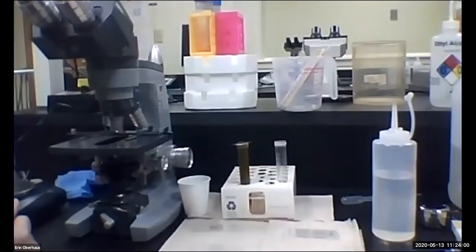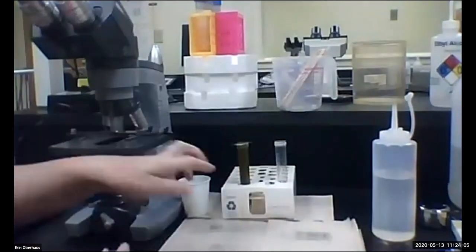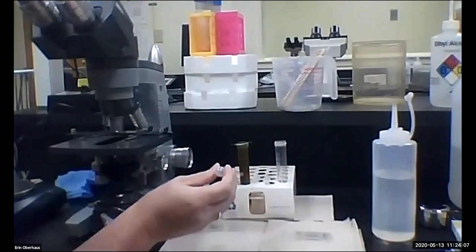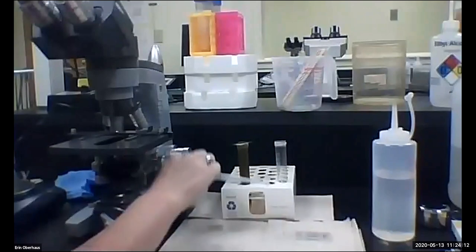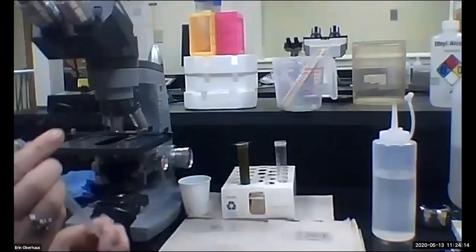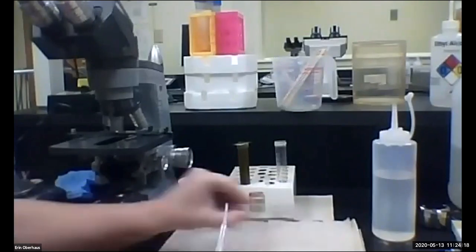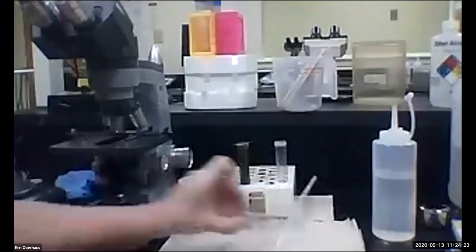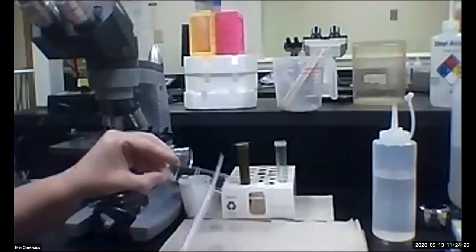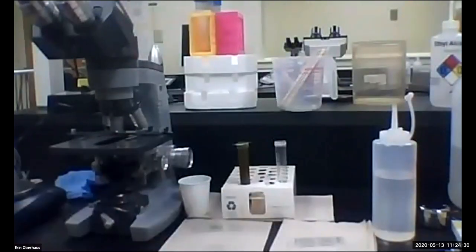If you were using the McMaster technique, you would take a transfer pipette and, instead of putting this into a tube with a cover slip on the top of it, you would probably just pour it into a clean container, mix it thoroughly, and sample from the middle of the sample and fill each of these chambers with it. See, when I take this cover slip off, I can demonstrate that. But you're going to fill each of these chambers with your solution. Let it sit for about 10 minutes.